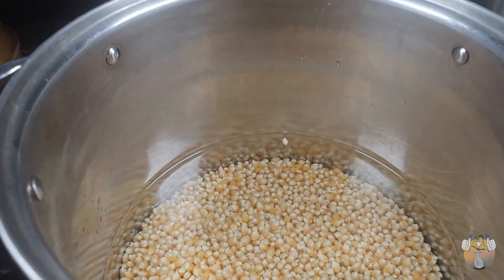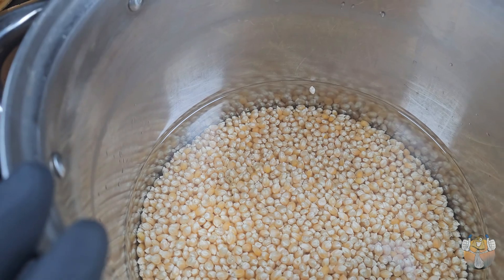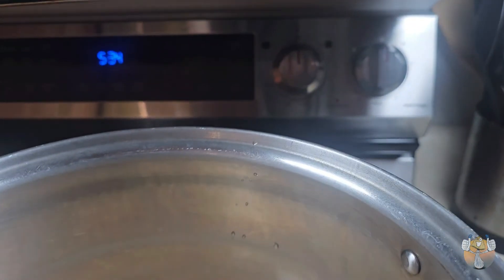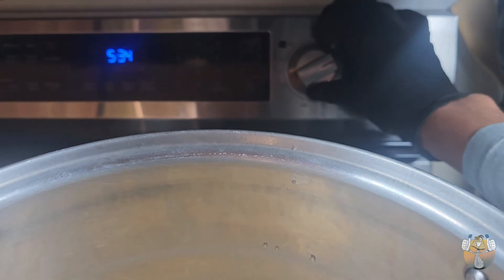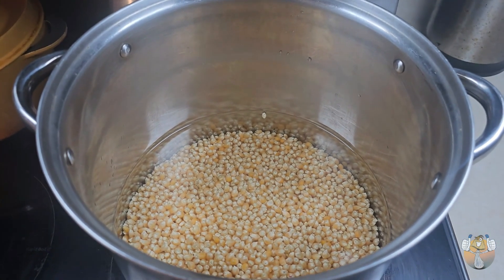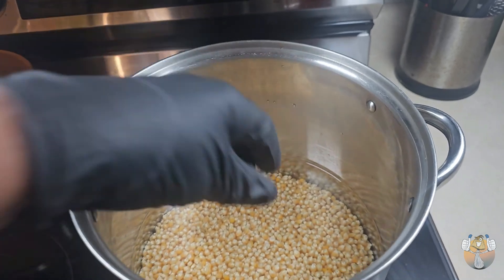So when we prepare our popcorn, first off I have about three and a half to four quarts of popcorn with about three to four inches of water above the popcorn, so that way once we get it simmering we don't want to burn it. We can just keep stirring with the simmer. I'm gonna bring it to about halfway and stir it every so often for about one to two hours depending on how the grain swells up.